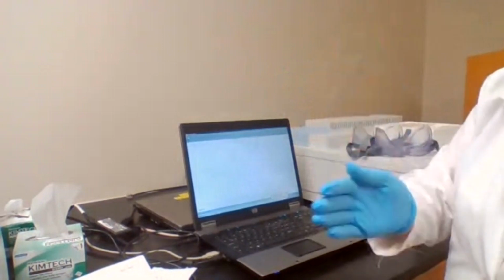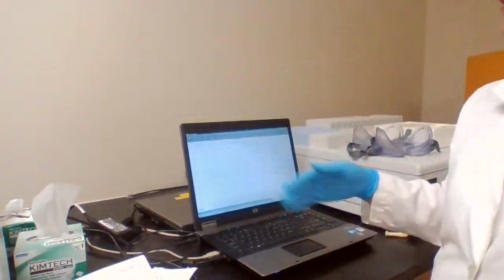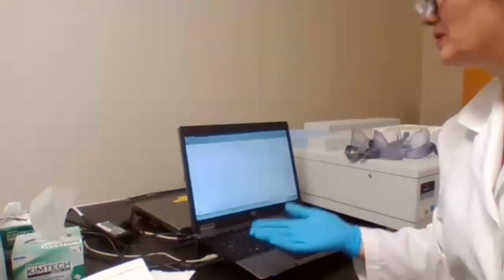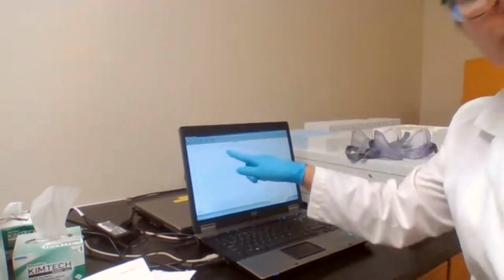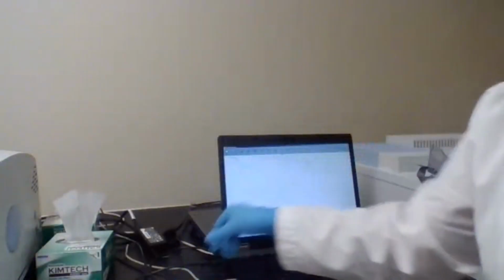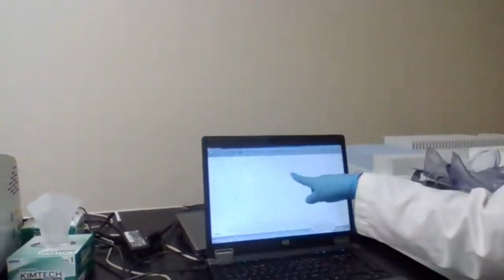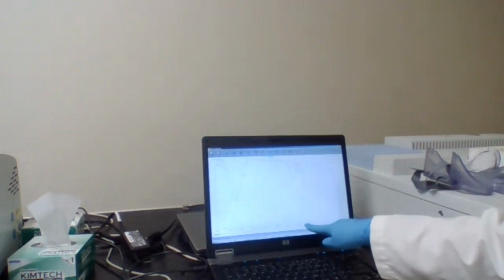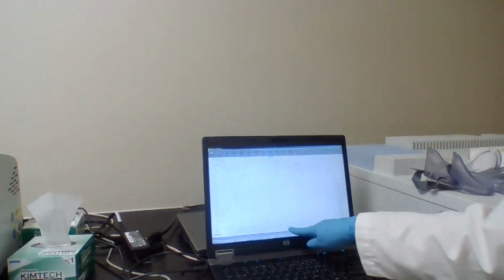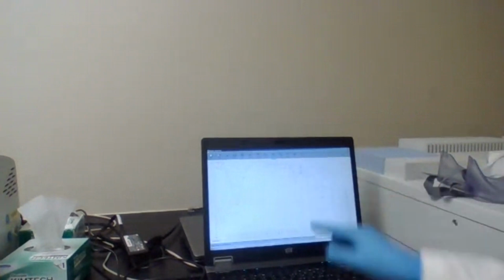But when you use the comparison of reactant to product, we are looking for points of difference only. So we are looking for the peak that appeared at 3300. What else are we looking for here? This was for a ketone. If you were going to have a ketone, you would have had at 1700 a sharp peak like this. But what is on the screen now, it's good that we don't have any peak at 1700. That's the 1600, 1800 range, and we don't have that sharp peak.